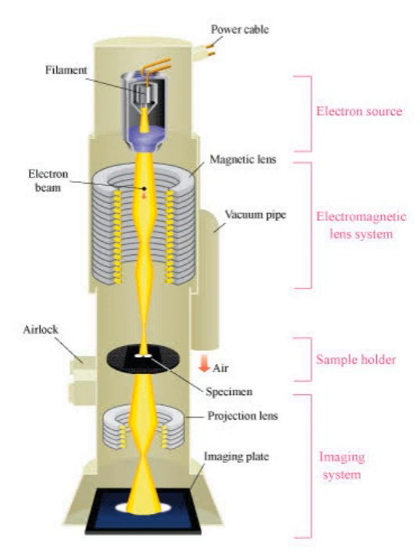The electron microscope has become indispensable in microbiological research because of the high resolving power of the instrument, which enables the visualization of the fine structure of bacteria, viruses, cells and tissues, which is not possible with the light microscope.